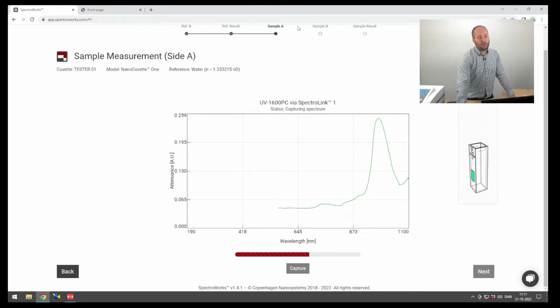So that's always sample A, which is going to be the traditional method of doing a colorimetric scan. The sample B, or B side, that we will go to afterwards, will be through the crystal, where we will measure the resonance and therefore also the refractive index, which directly correlates to the Brix value.